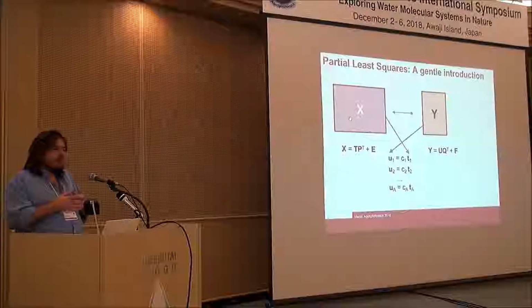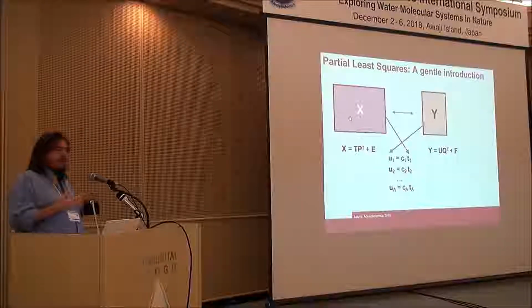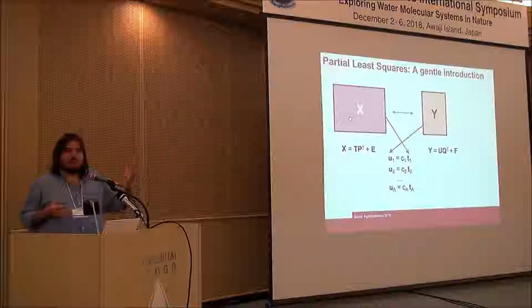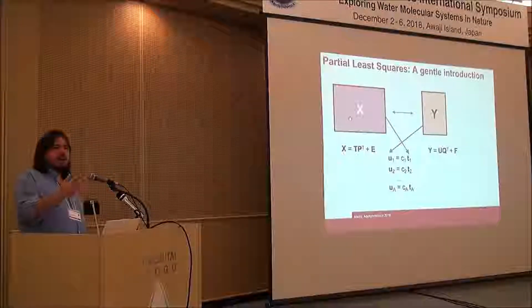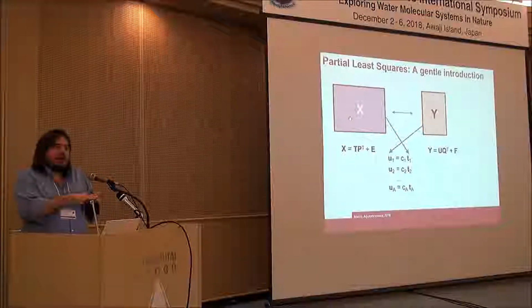We do PCA, dimensionality reduction or compression, because it's comfortable for us to deal with a small number of variables. But we do it also because we want these variables to be explicative, because we want to have an idea of the correlation structure underlying our data.